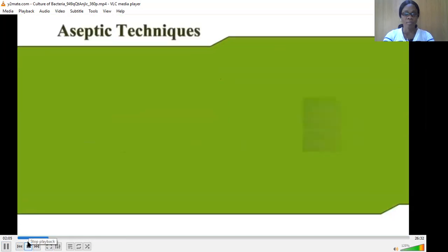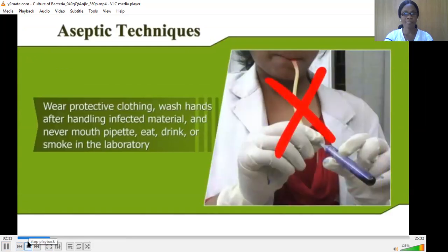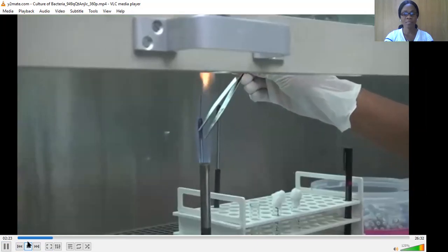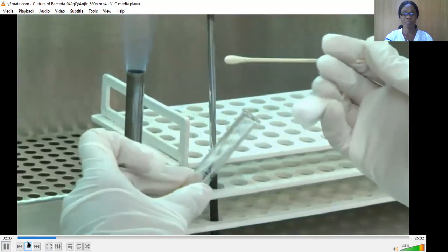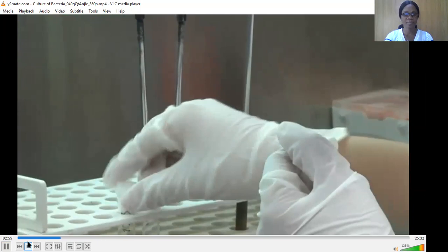Aseptic techniques. Wear protective clothing, wash hands after handling infected material, and never mouth pipette, eat, drink, or smoke in the laboratory. Flame to sterilize wire loops, straight wires, and metal forceps before and after use. Flame the necks of specimen bottles, culture bottles, and tubes after removing and before replacing caps or plugs. When inoculating, do not let the tops or caps of bottles and tubes touch an unsterile surface. This can be avoided by holding the top or cap in the hand. Always use racks to hold tubes and bottles containing specimens or culture media.